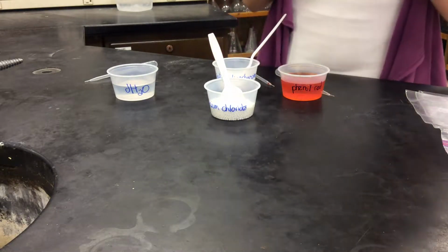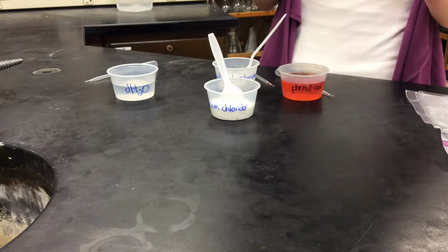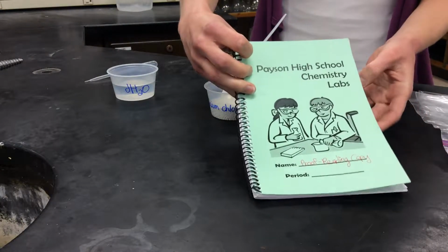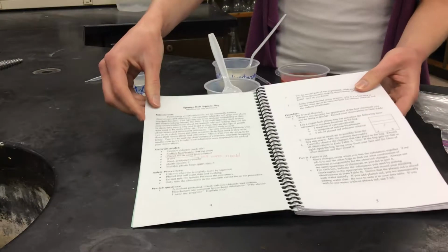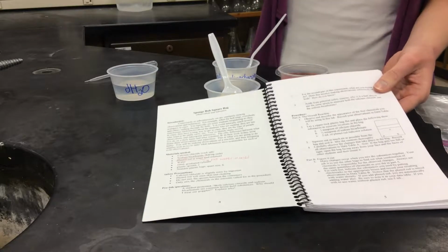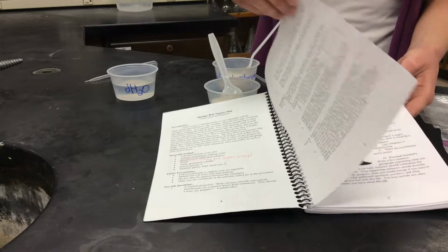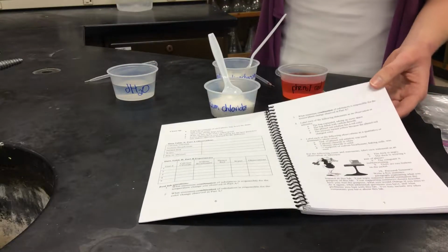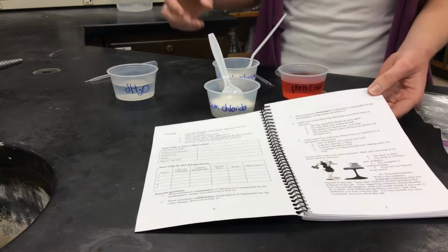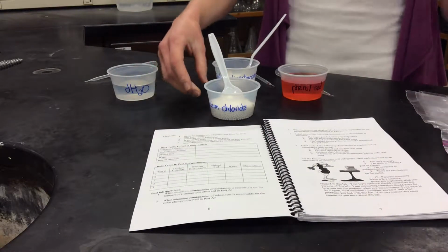Okay, so today we will be doing the SpongeBob Square Bag Lab, which is found on page 4 of your lab book. If you don't have your lab book, you can always just open the Google Doc and fill out the data straight on the Google Doc. Okay, it's all there. We're going to actually start on page 6, and we're going to start by filling out this data table.